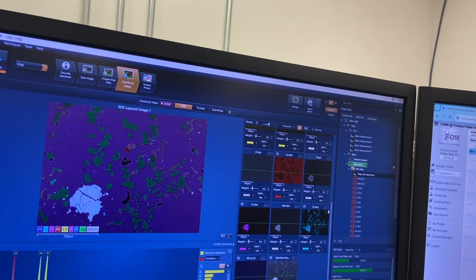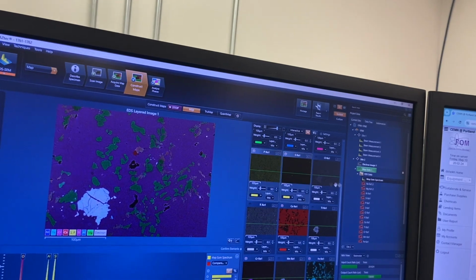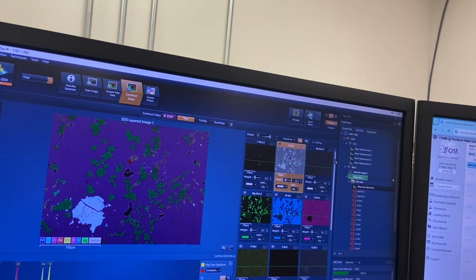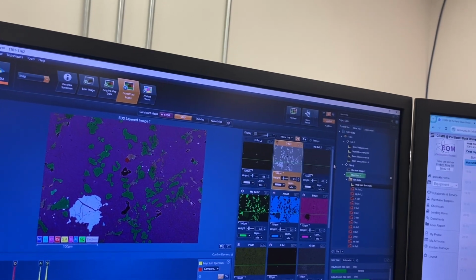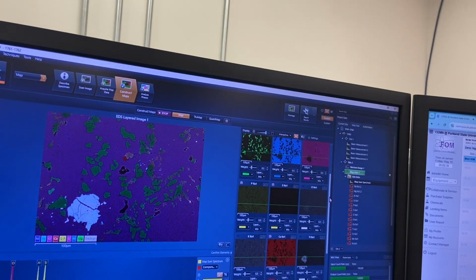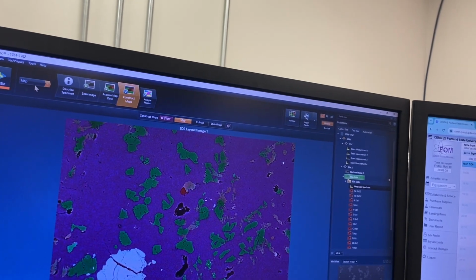So obviously if you want to view it as more incompatible, I'd imagine the phosphorus in the matrix. Yeah, that makes sense because you didn't put it into a phosphate. Yep, silicon, sodium more in the matrix makes sense. What about potassium? Can I even get a signal? Yeah, I can get a slight signal. That works. All right, so I think this is lunar, but we'll find out.